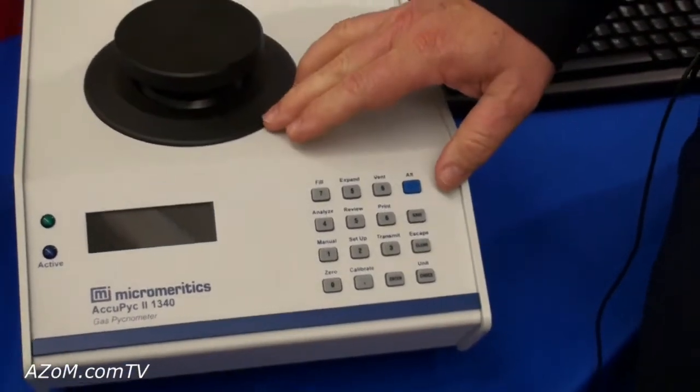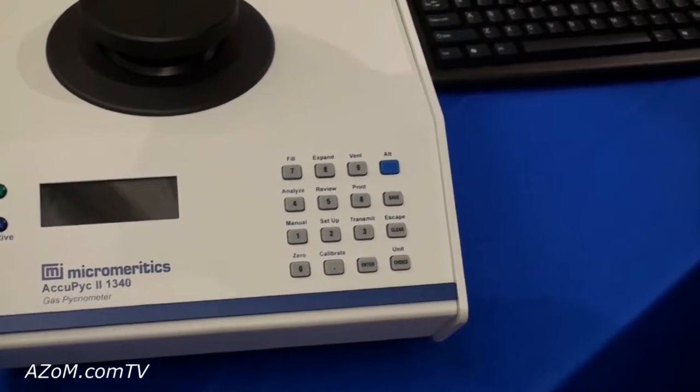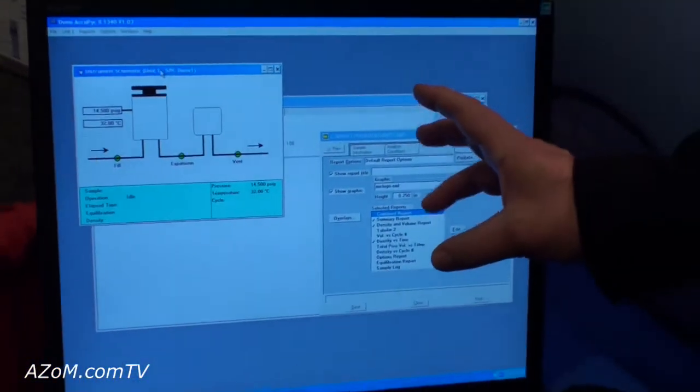The AcuPic has its own built-in microprocessor or it can be controlled from a PC. If you are controlling it from a PC, we've got all the ability to collect the data here and report it.